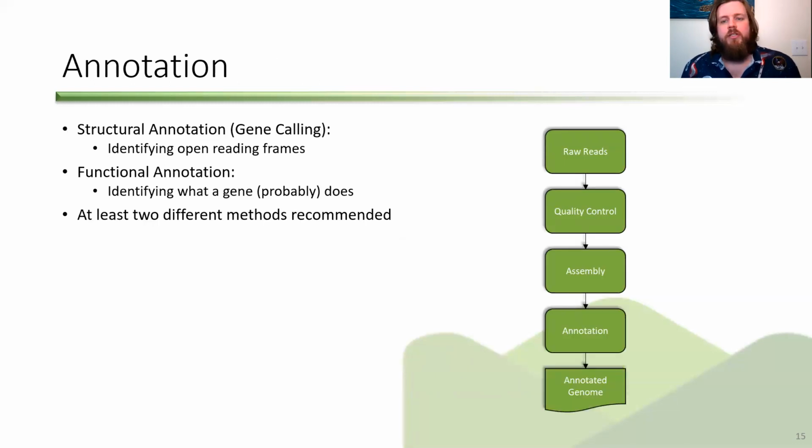Now, once you're done with that, you can move on to the assembly. There are some other things you can do with your nucleotide, your contig. If you have enough reads, you can do a variant analysis, which I do like to do. But that's not something that's universally done and not something you really have to do. I like doing it because if I have the reads, I like to use them. And I also like to know just how many variants, how many mutations are found in the reads for my contig. In general, we do really deep sequencing.